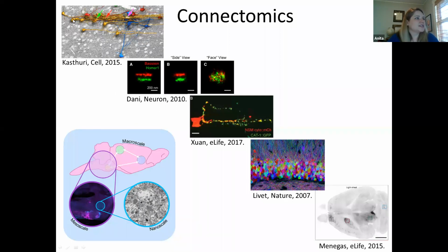So here's a recent example from Jeff Lichtman's lab, where they've done dense reconstruction of several neurons using EM. This is obviously a very data dense type of tracing. They have to take these very thin serial sections on EM. They have a specialized slicer that collects all of the sections on a tape. It's not even done by a person.